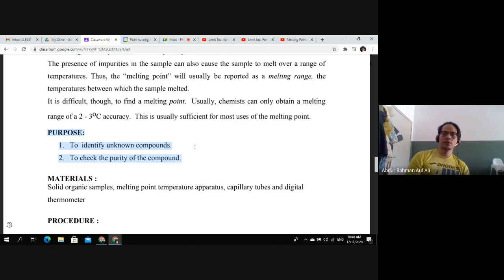Okay, kalau lah contohnya macam kita buat melting point test pada Panadol tablet and dia punya melting point is 172. So that means the active ingredient of that tablet, dia punya purity dia rendah sebab ada bahan-bahan yang lain lagi bercampur within that. Because certain bahan melting point dia lebih tinggi daripada paracetamol API tadi, maybe 172. So that means that content of paracetamol in that tablet is less than it should be, probably.